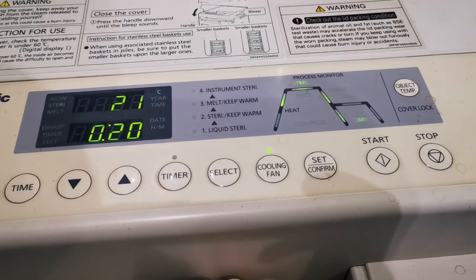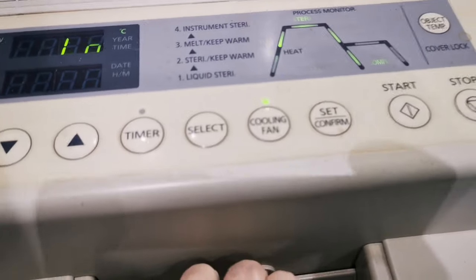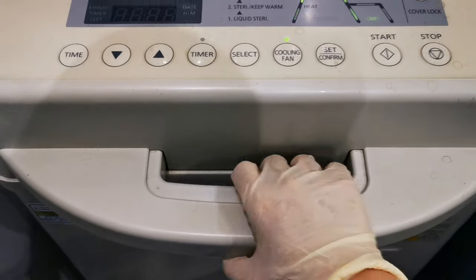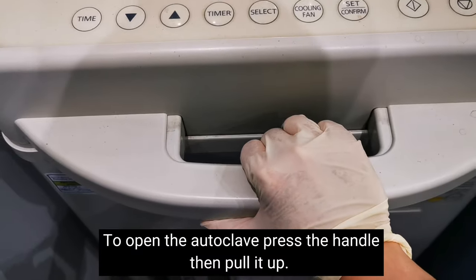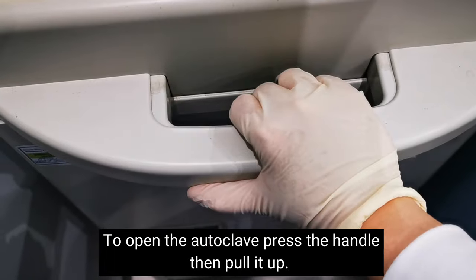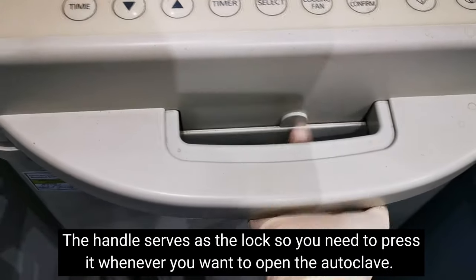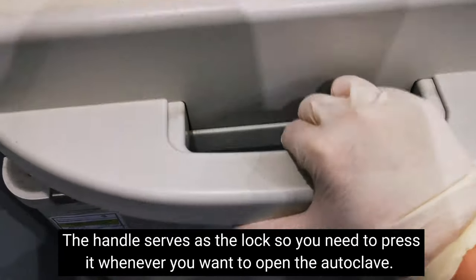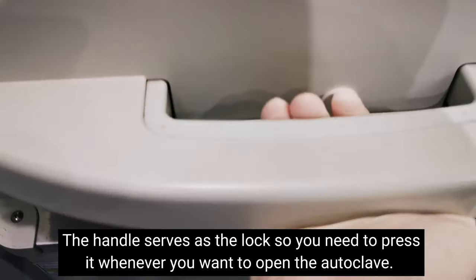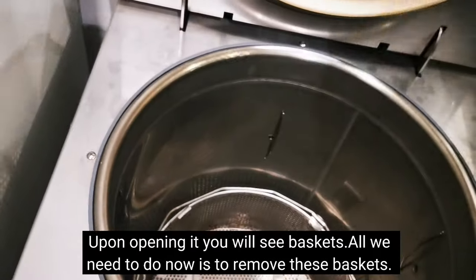After what we did, we can open the machine now. Just press the handle going towards the upward position. You need to press the handle while lifting — if you don't press it and just lift, it won't open. So to open it, press while lifting. Now we can see the inside of the autoclave — there's a basket.